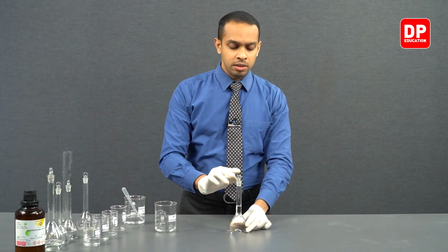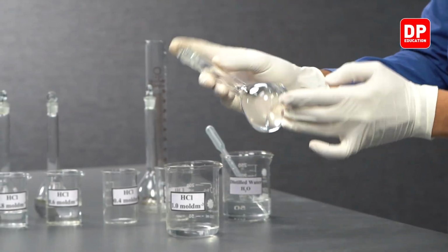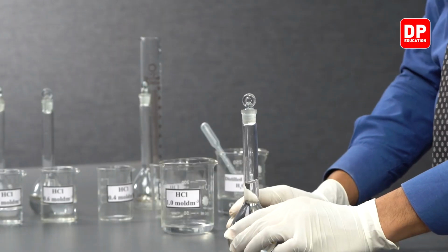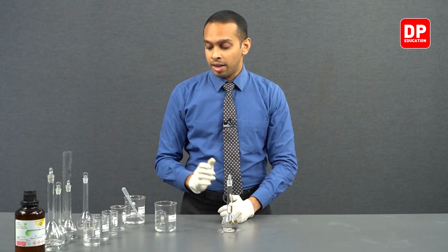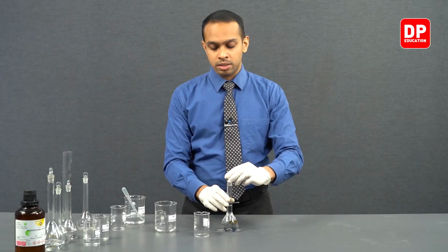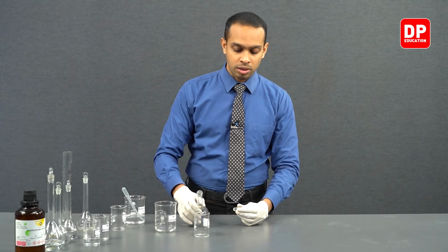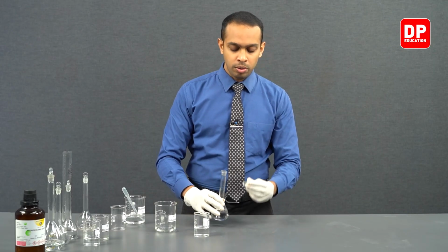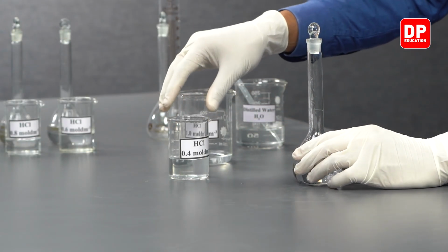After that, you can place the stopper. You can turn the volumetric flask upside down a few times like this. Then you have prepared your 0.4 moles per decimeter cubed concentrated HCl solution. So we can take this beaker that has the label 0.4 moles per decimeter cubed HCl, and we will transfer a small amount of our 0.4 moles per decimeter cubed concentrated HCl solution into our beaker.